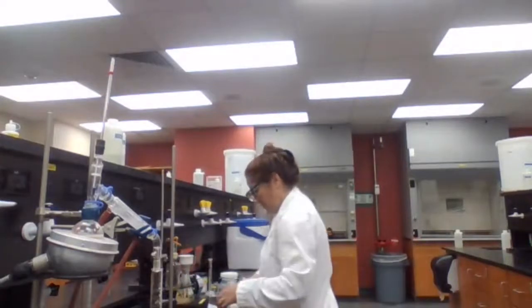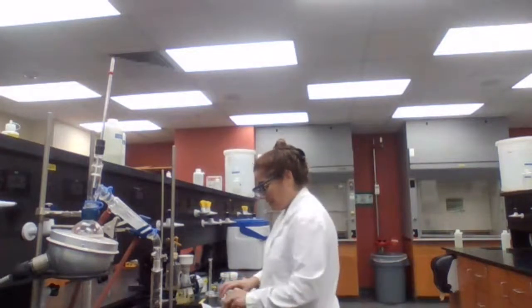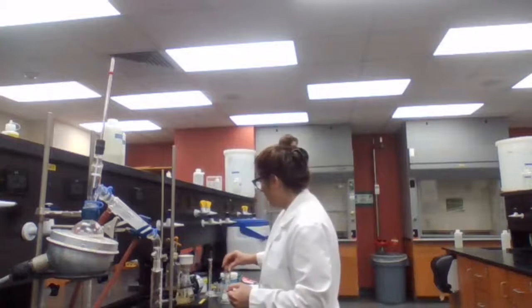Equipment that I don't need, I can put away, so it's not in my way.